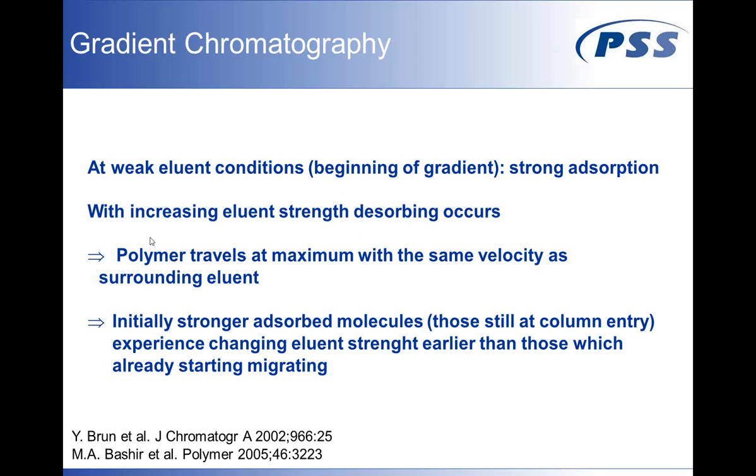We have seen that critical chromatography is just at the border between size exclusion, where your polymer migrates faster through the column than your solvent, which is the reason why in your size exclusion chromatogram you see the solvent peak at the end, and isocratic adsorption, where your polymer will elute later than the solvent peak.